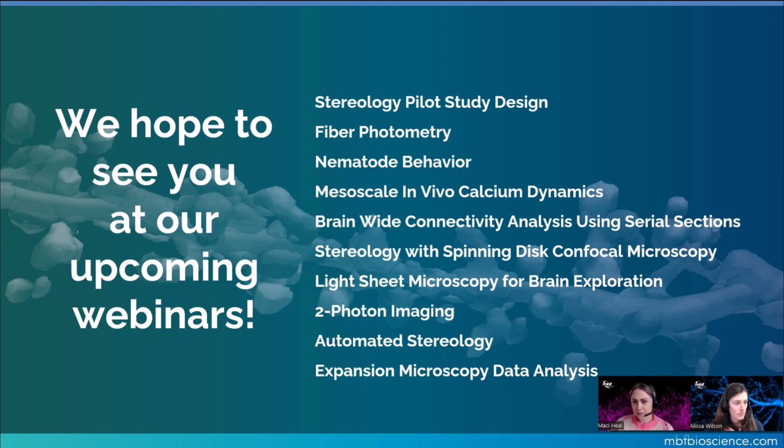And that goes back to what Alissa had mentioned at the very beginning of the question and answer session, which is there are other tools in the Neurolucida 360 software that we didn't go into today, but that can be utilized to answer questions like that, specifically the puncta tool. The puncta tool can be used to detect various punctate objects of different shapes and sizes.